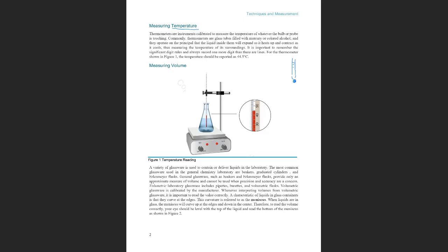If you look at this drawing, zoom in on your screen if you don't see the thermometer big enough, because we want to make sure that when you look at this thermometer, you know how many digits you have to add to your number. So when we have a scale, what is the first thing that we need to do when we have a thermometer? We take the thermometer in our hands and look at it. Well, we have to look at the scale. That is the key.